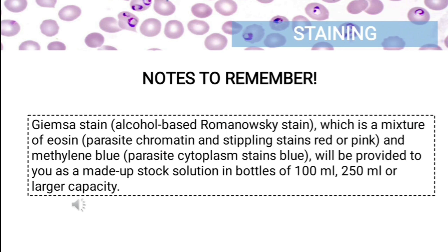And then do not add water to the stock solution. Even the smallest amount will cause the stain to deteriorate, making staining progressively ineffective. Do not shake the bottle of stain before use. Shaking suspends the precipitates which settle on the films during staining, and it will obscure important details during microscopy. And then lastly, do not return unused stain to the stock bottle. So once the stain is out of the bottle, it must be used immediately or discarded.